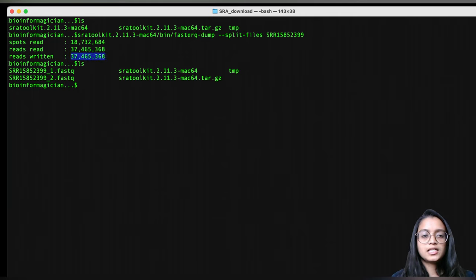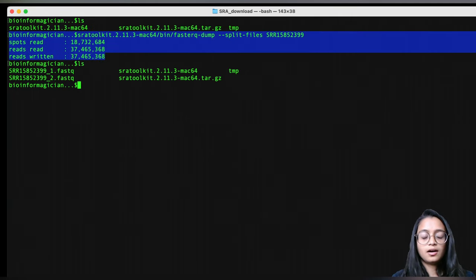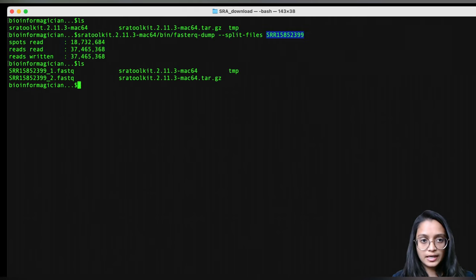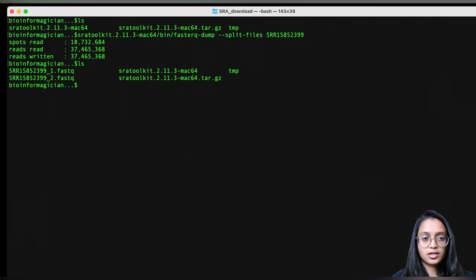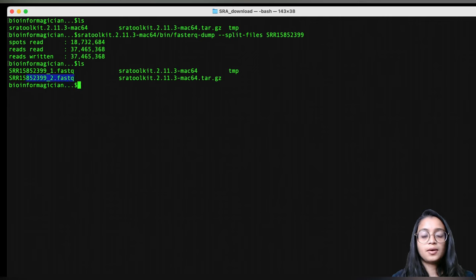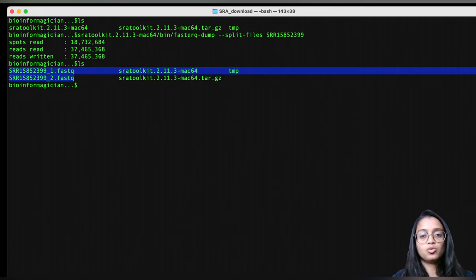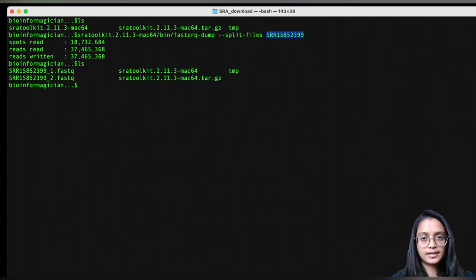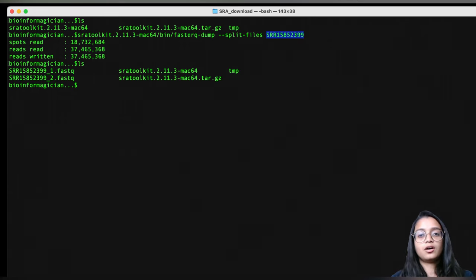We can see that it has finished downloading the sequencing reads associated with the SRR ID. When we check the contents of our folder, we can see two files generated ending in .fastq. There are two files because these are paired-end reads, so we have two FASTQ files containing sequencing reads associated with this SRR ID. That's how we use the SRA Toolkit to download sequencing data available on NCBI to our local system.